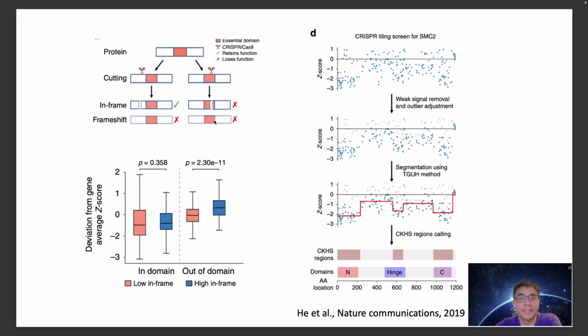And if you look at this plot, we have done this large scale analysis on CRISPR tiling screen data. We found that for in-domain indels, no matter whether they are in frame or out of frame, there is no significant difference.